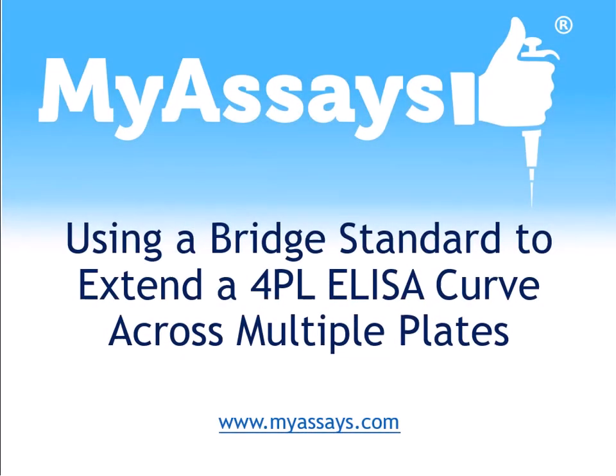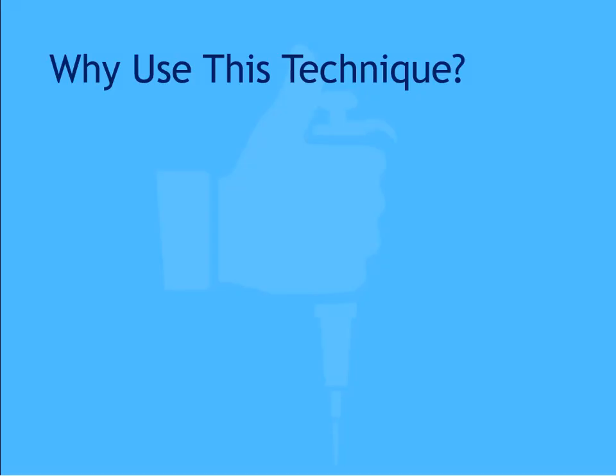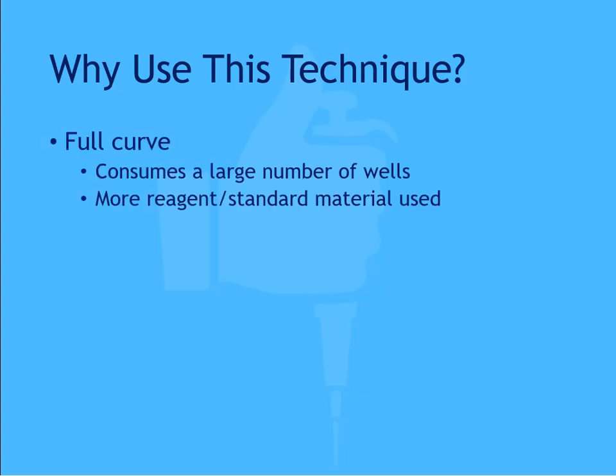In this video, we'll go over why labs might use a single standard curve fit across multiple plates and how a bridge standard and QC sample can be used to normalize and verify acceptability. In many ELISA workflows, especially when running large batches across multiple plates, a full standard curve on each plate can consume a large number of wells and a significant amount of standard and reagent material.